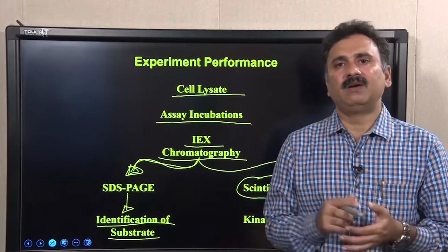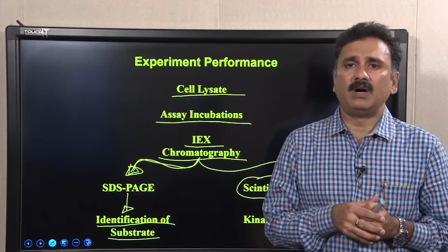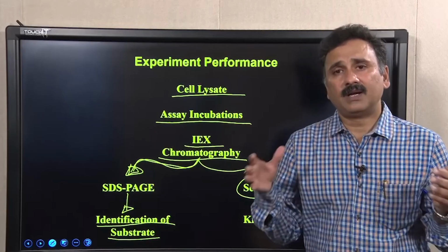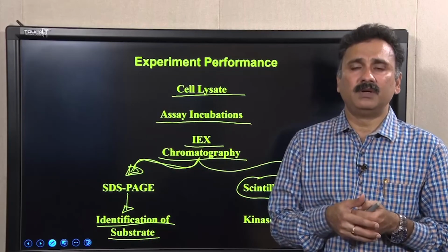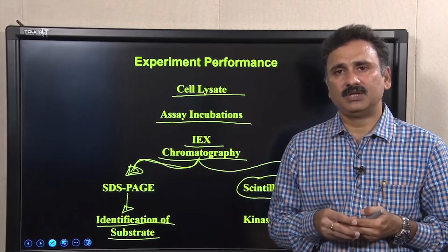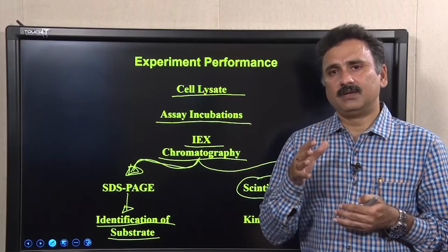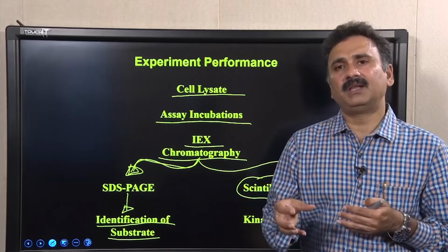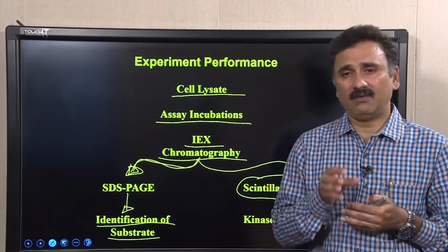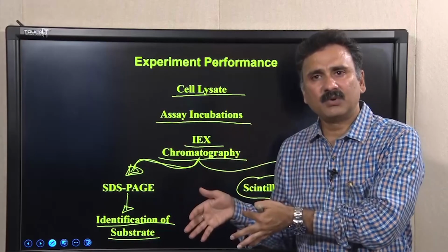We have discussed the basic principle of ion exchange chromatography, the different steps you have to follow, the crucial parameters you have to consider when running it, and how these parameters are crucial to choose the specific matrix as well as the specific pH at which to perform the chromatography, and the different buffers available for cation exchange as well as anion exchange chromatography.